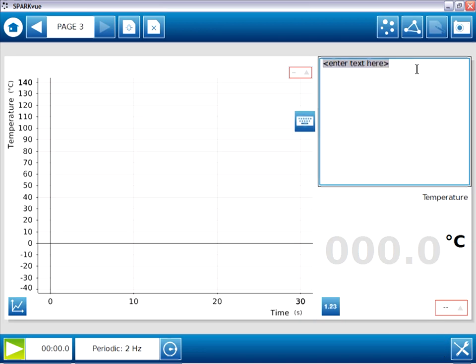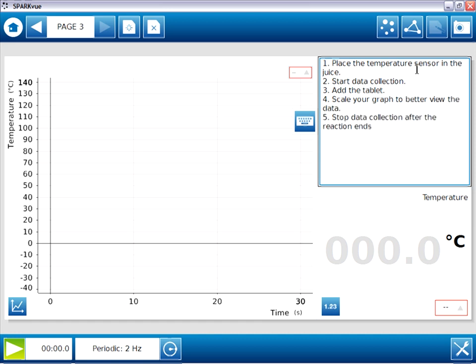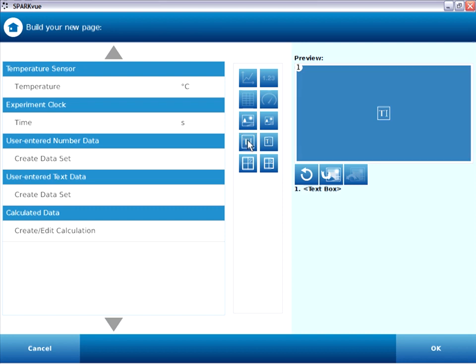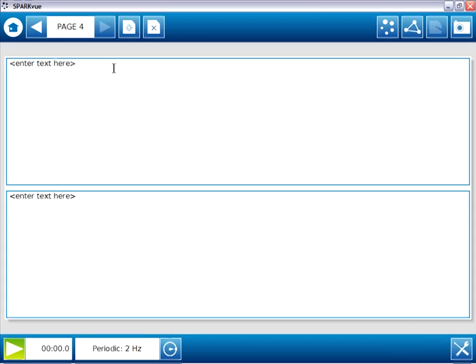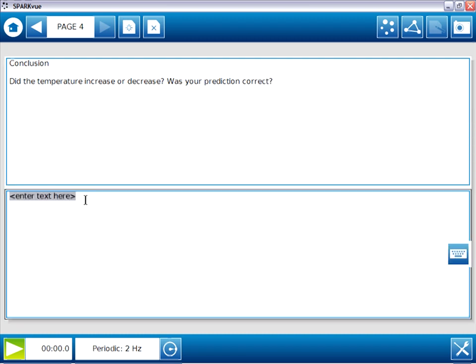And in this text entry box, I will type in the instructions for collecting data. So instructions are complete, and this page is finished. Onto the last page, page four, build new page. And this page, we're simply going to have two large text boxes, one on top of the other. So large text box, another large text box, and okay. And this will be the conclusion page. And once again, I'll provide some leading text in the bottom for our students to respond.